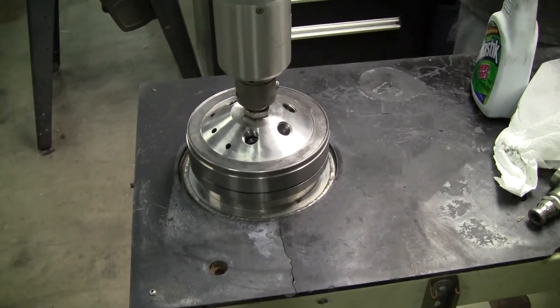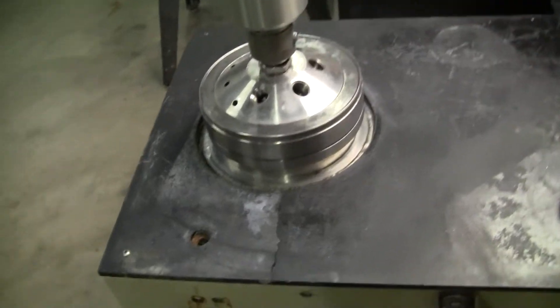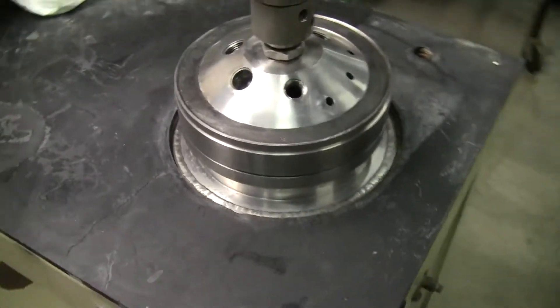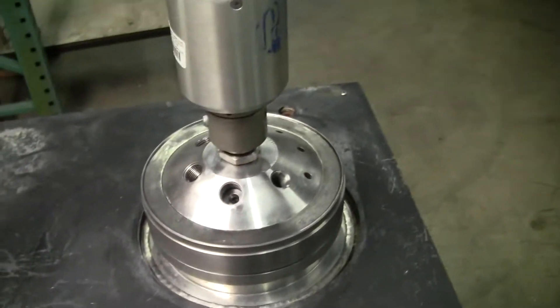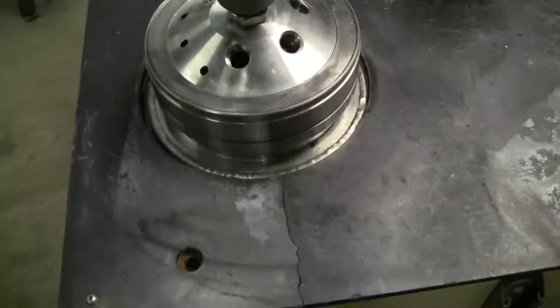Hi, this is Michael Natow from Hitech Trader. Today we're looking at the Hestaloid B PAR Reactor. My colleague Chris and I — this is it cleaned up a little bit. We've taken off parts as part of our cleaning process. Chris, why don't you lift up the reactor.